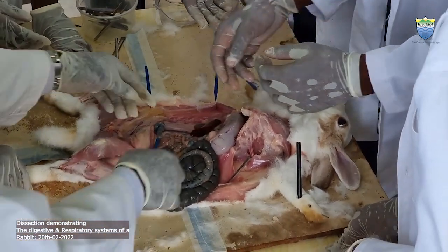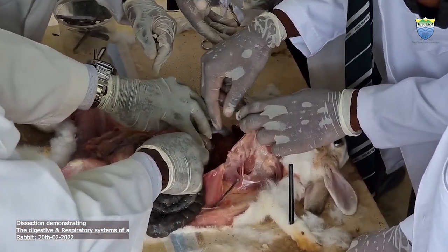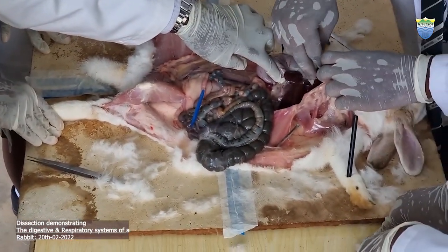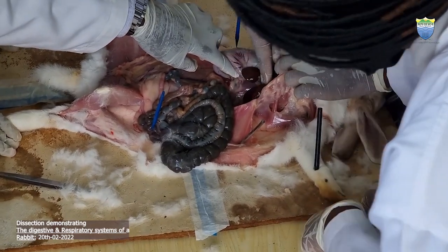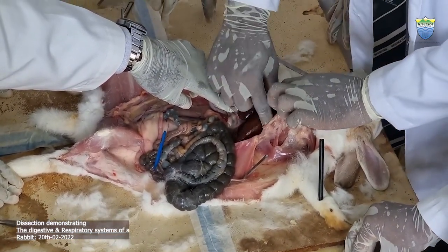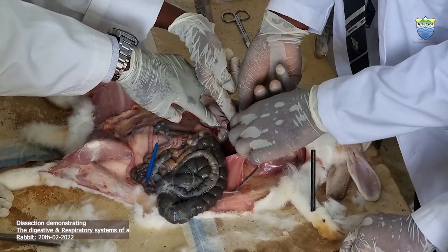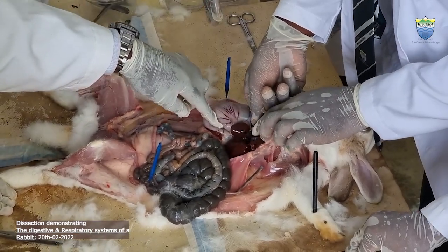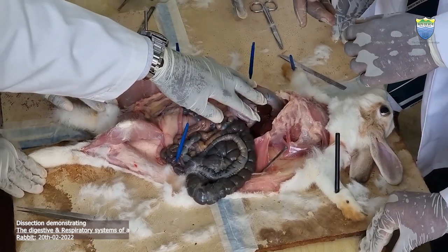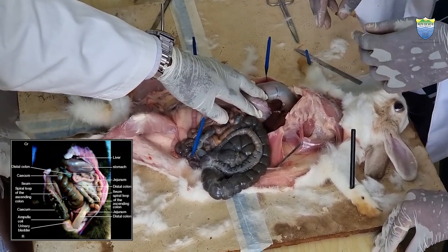But before we go to the urinary bladder, I have seen some other things. This is the liver, and inside here, how many lobes does the liver have? The liver has three lobes, and this includes the gallbladder, which contains the bile. May I know the functions of the gallbladder? What's the function of the bile?